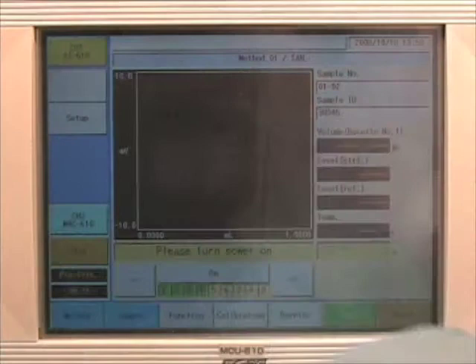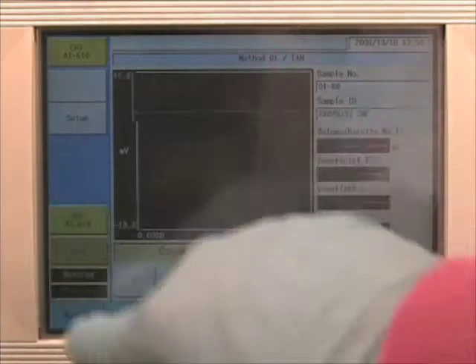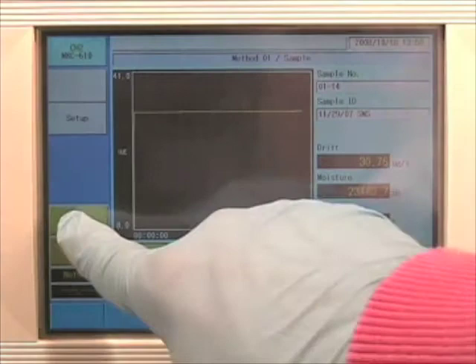So it's really that simple, just back and forth. And all the buttons are touch screen. Right now on the Karl Fischer we are in a pre-titration mode.